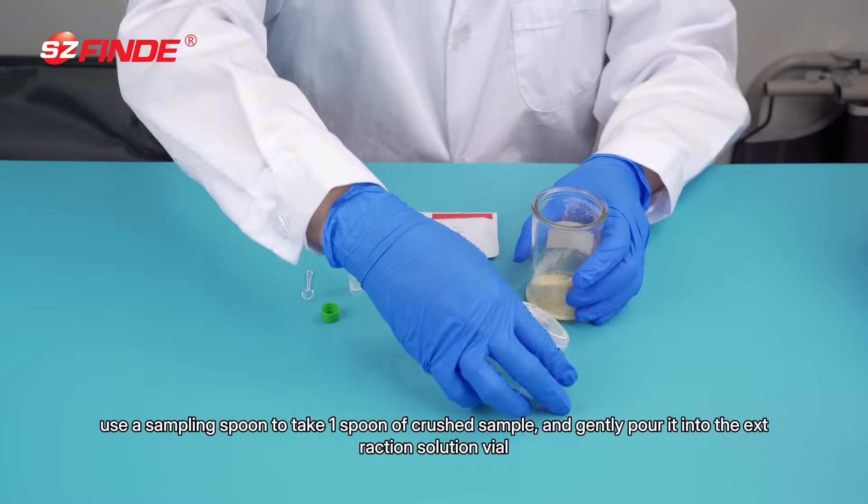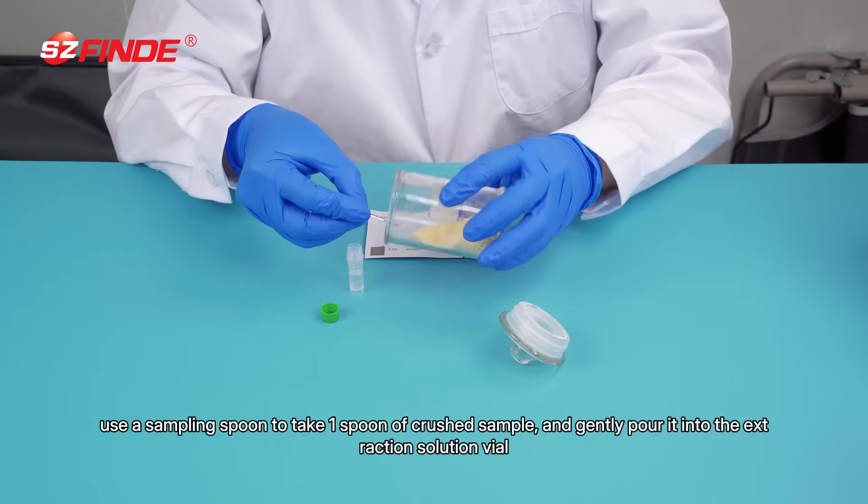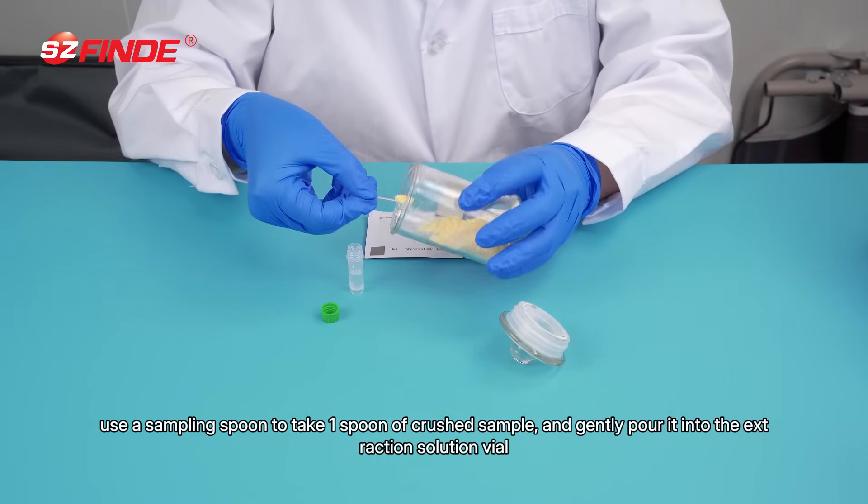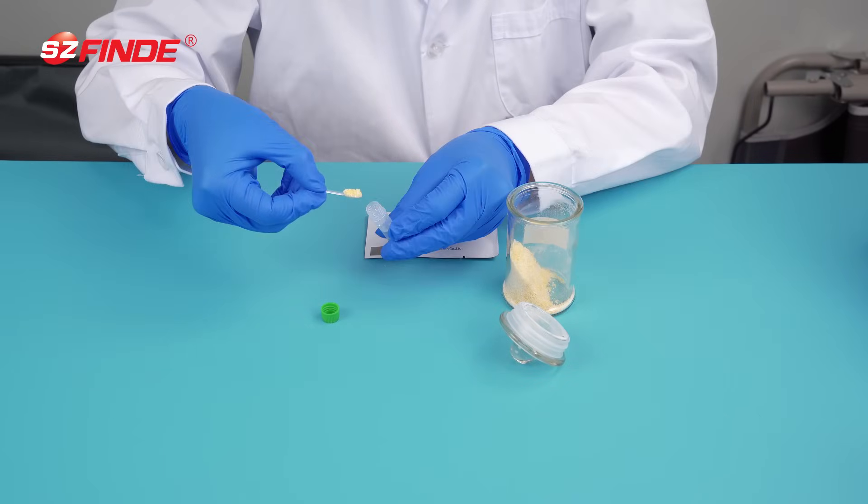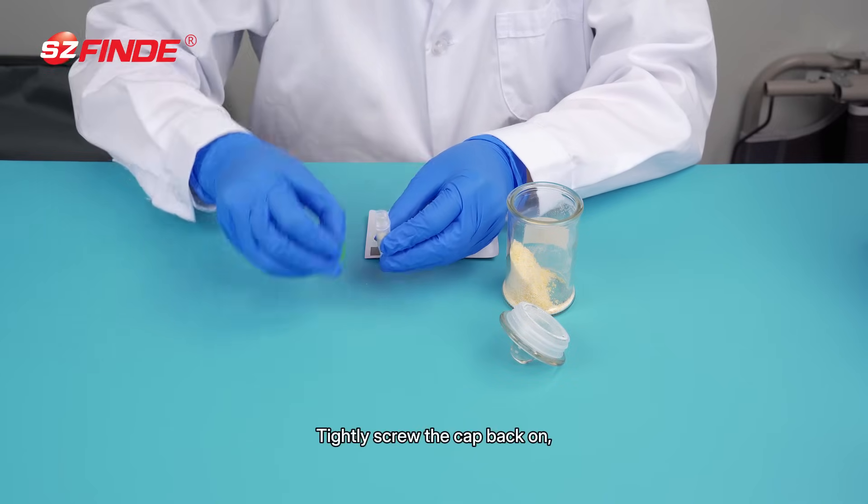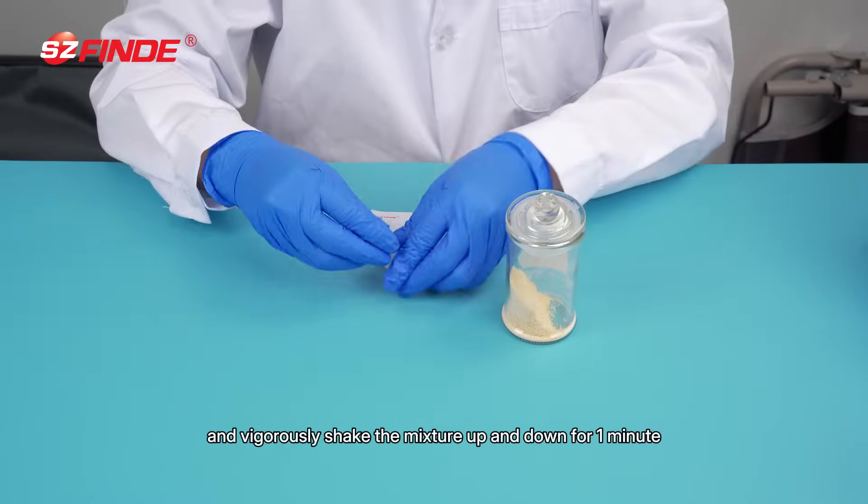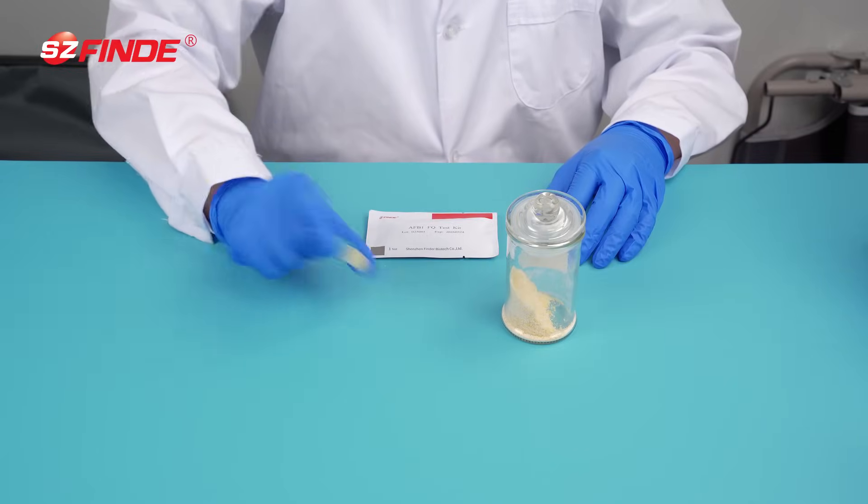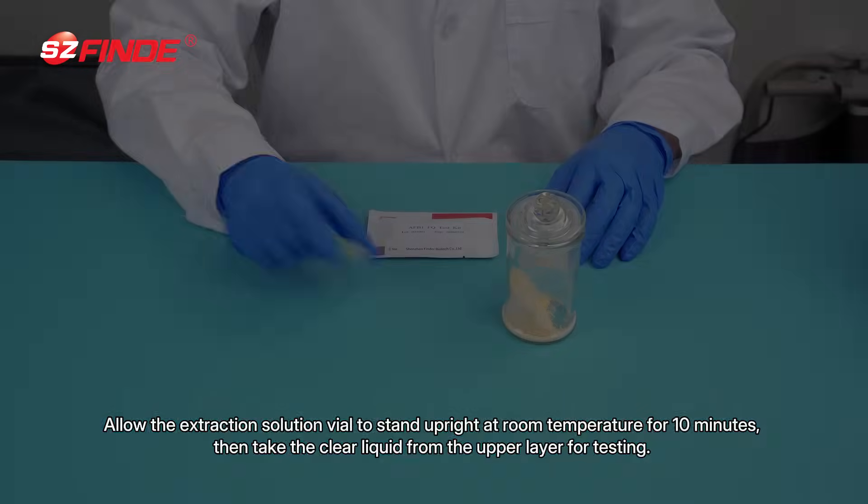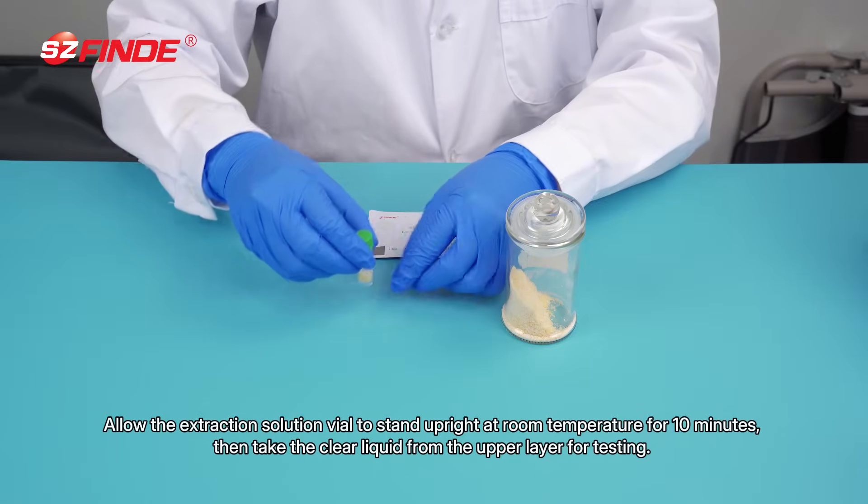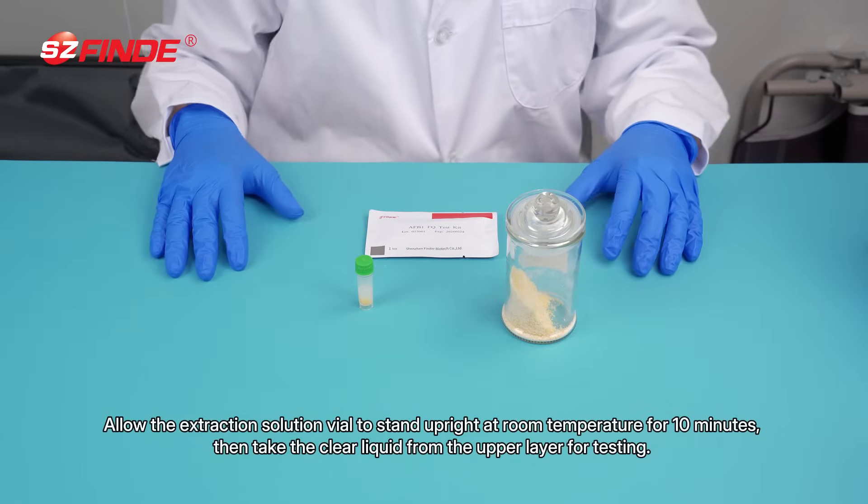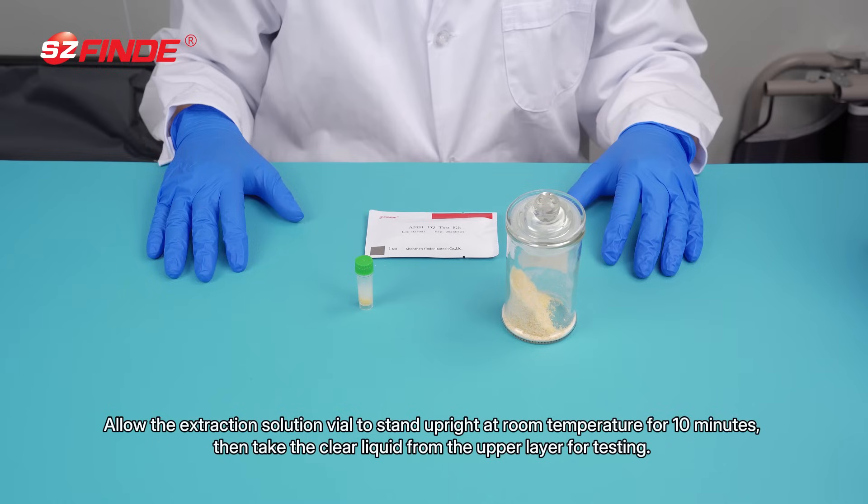Use a sampling spoon to take one spoon of crushed sample and gently pour it into the extraction solution vial. Tightly screw the cap back on and vigorously shake the mixture up and down for one minute. Allow the extraction solution vial to stand upright at room temperature for 10 minutes, then take the clear liquid from the upper layer for testing.